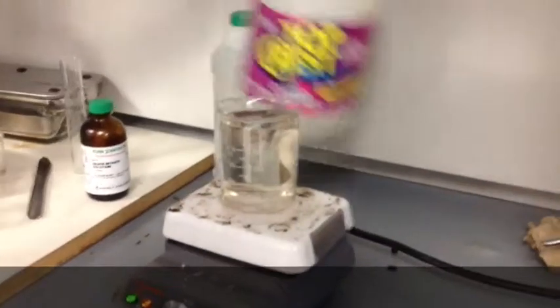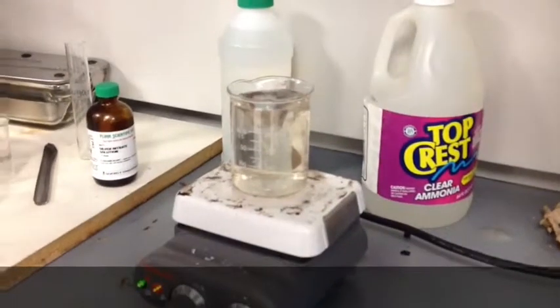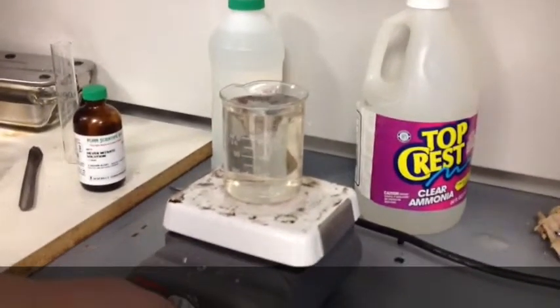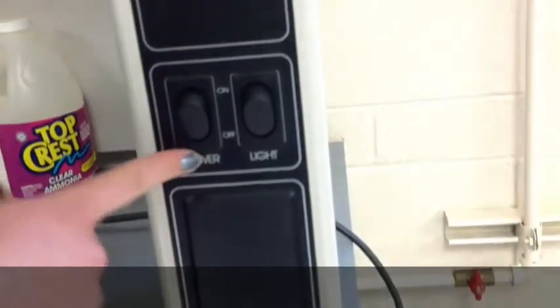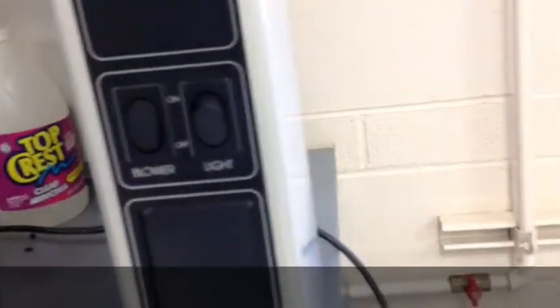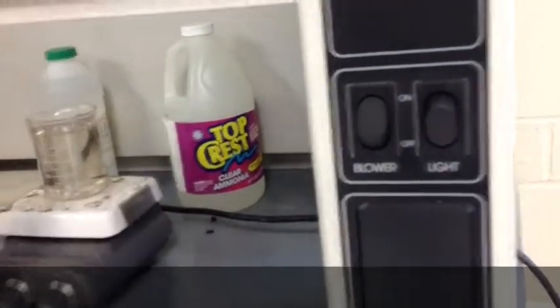Then you can probably start to smell the ammonia. You want to do this either outside or under a fume hood for safety reasons. After you get it stirred up, turn off the stir. You can smell the ammonia — turn on the blower and pull the hood down a little bit.